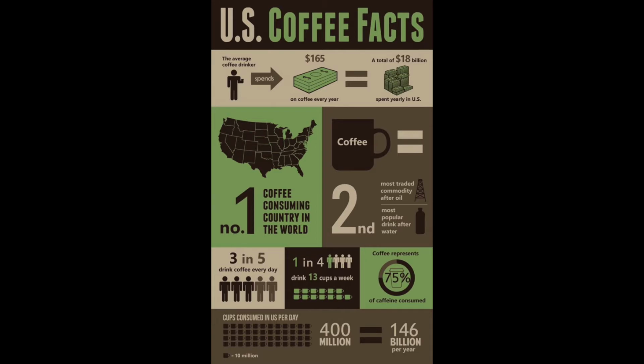The motivation for this experiment is to determine optimal conditions for the extraction of caffeine from coffee grinds. These conditions include, but are not limited to, the optimal temperature, the optimal grind size, and the optimal flow rate.